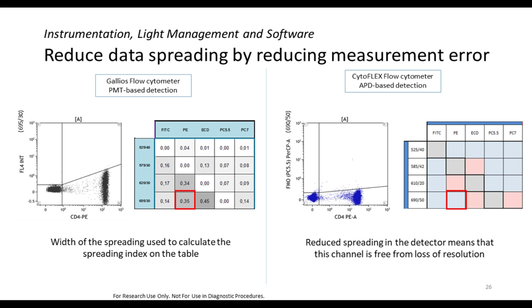While on the right, where we don't have this restriction, there is no spreading. We basically are very, very free in what we want to put here, which co-expression markers or which other markers should go there. So it gives us a lot of flexibility, and there's very little restriction on the biological relationship of the antigens that can be detected in such a setting.